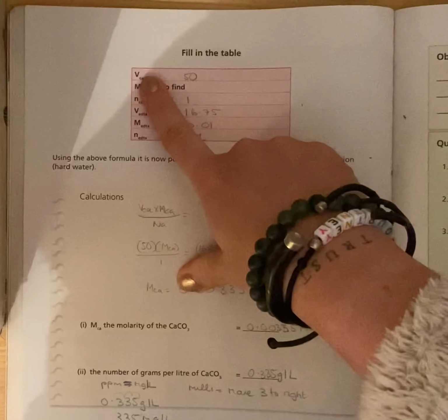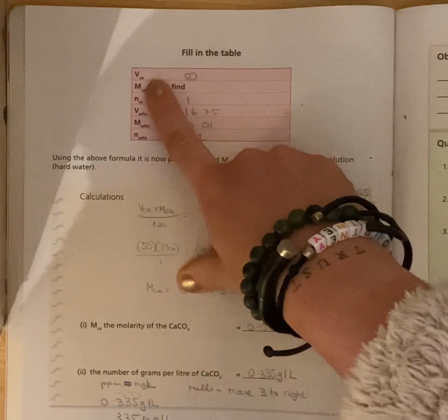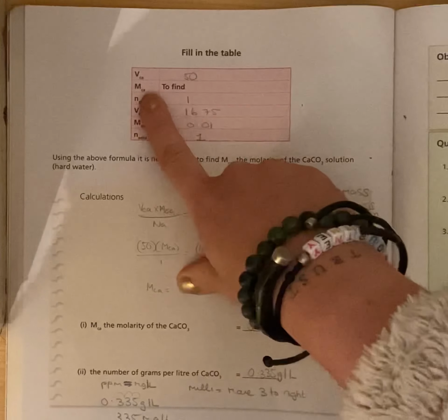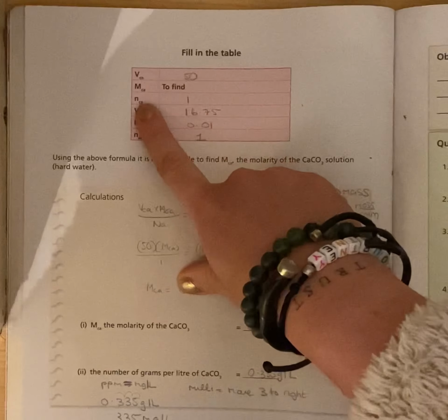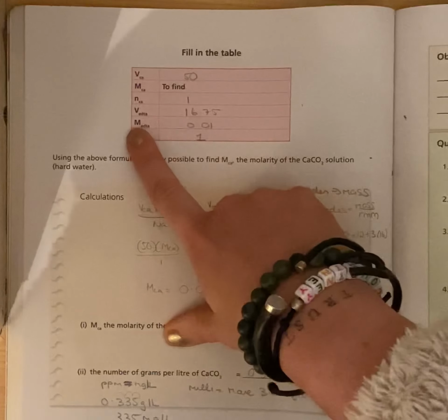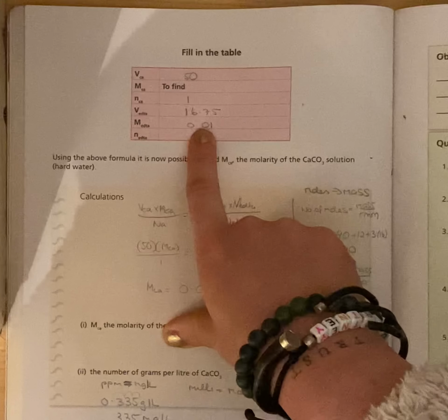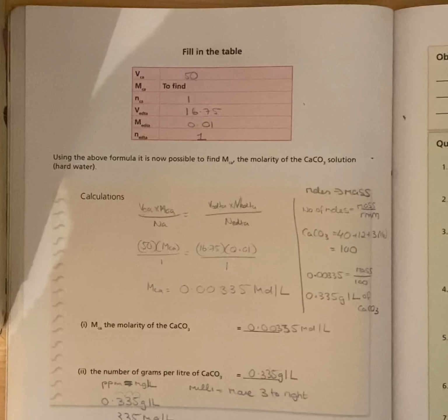Okay, so here's all that we should have filled in up here. So the volume of the calcium, or the water, the hard water, is 50. That's in your conical flask. We need to find out the molarity of the hardness in the water. The number that's connected to the calcium is 1. We see that from the last page. The volume of the EDTA, that's your average titer. The molarity of the EDTA would be 0.01. That should be the same for you. And the number is 1 as well.